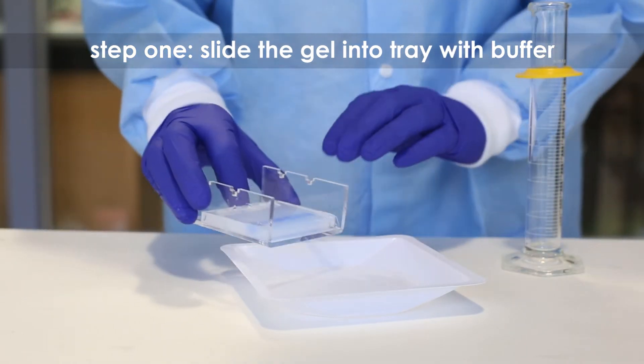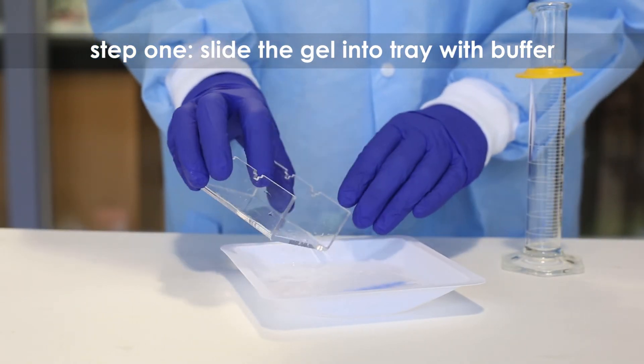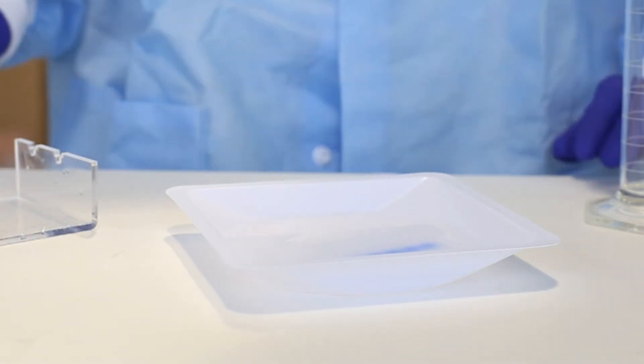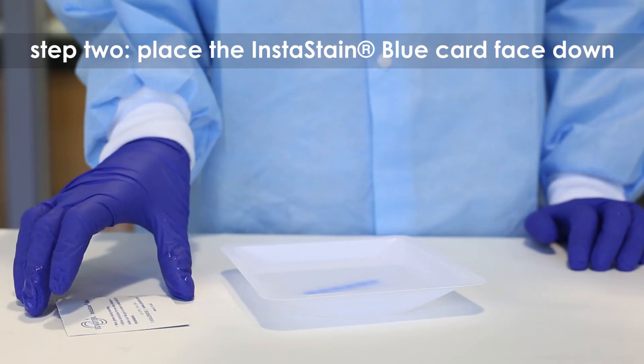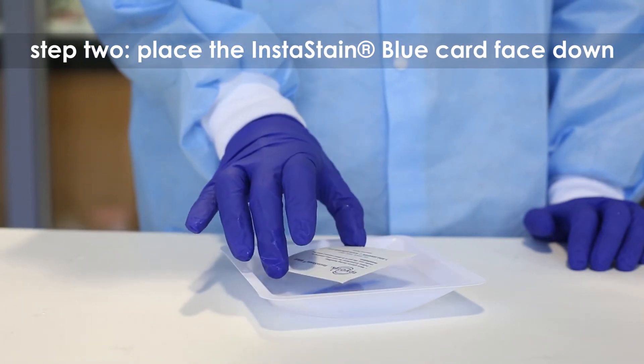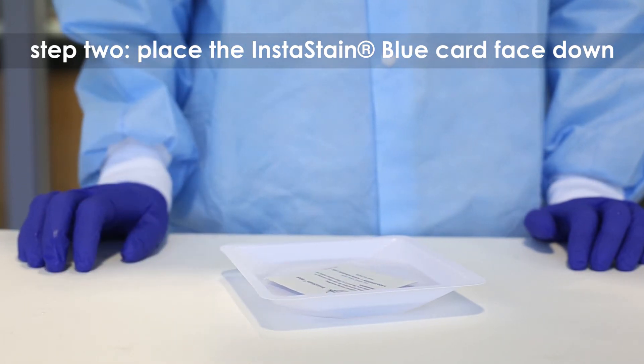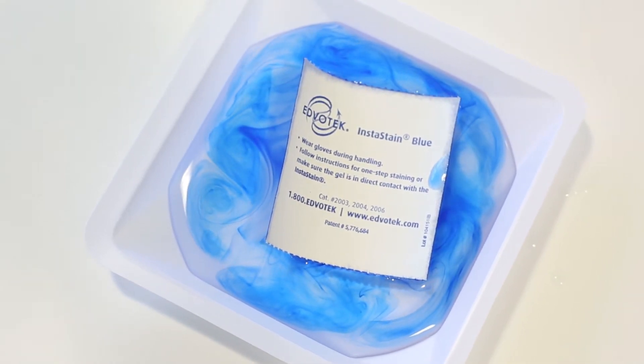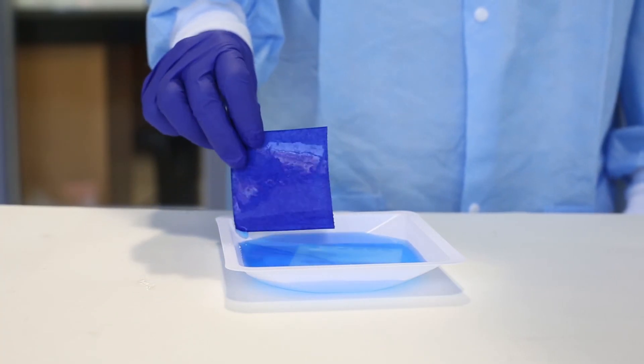The gel should be completely submerged. Step 2: Gently place the InstaStain Blue card on top of the liquid with the stain facing the gel. Remove and discard the InstaStain after 30 to 60 seconds.